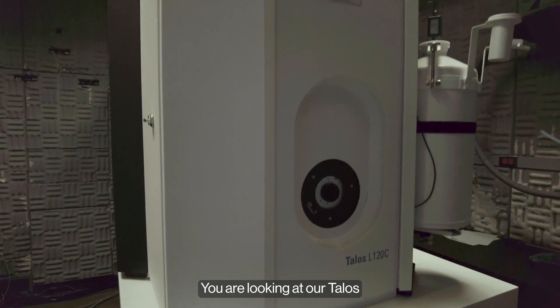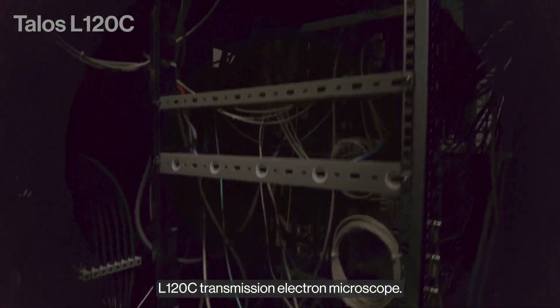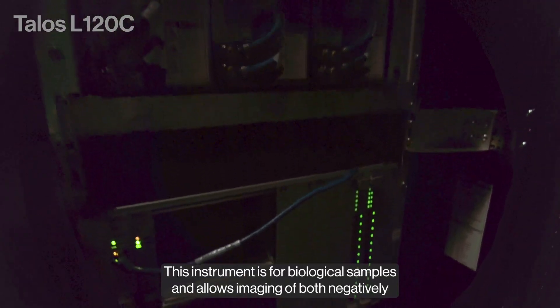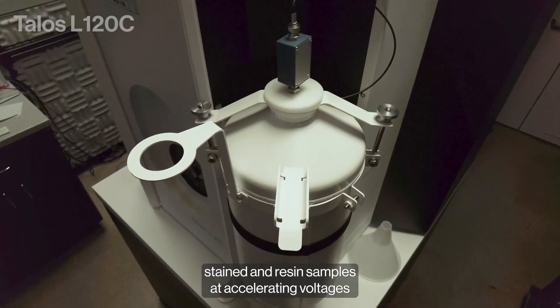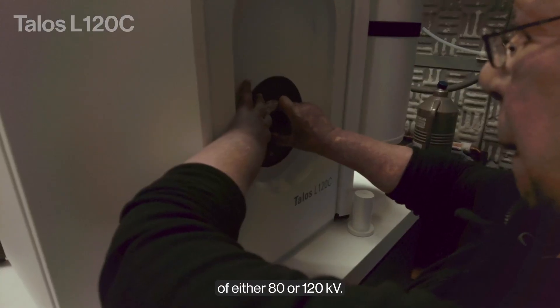You are looking at our TALOS L120C Transmission Electron Microscope. This instrument is for biological samples and allows imaging of both negatively stained and resin samples at accelerating voltages of either 80 or 120 kilovolts.